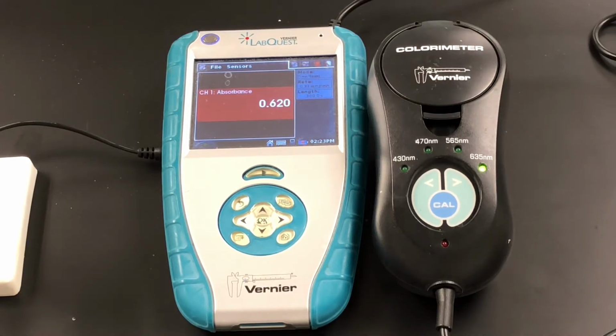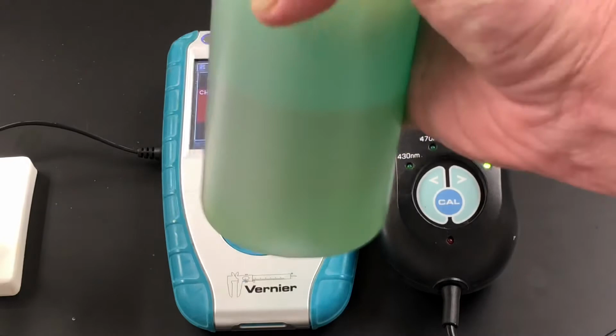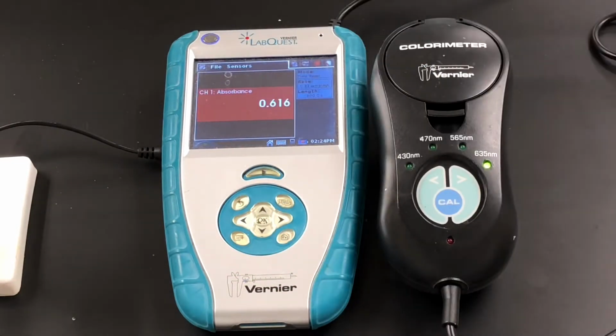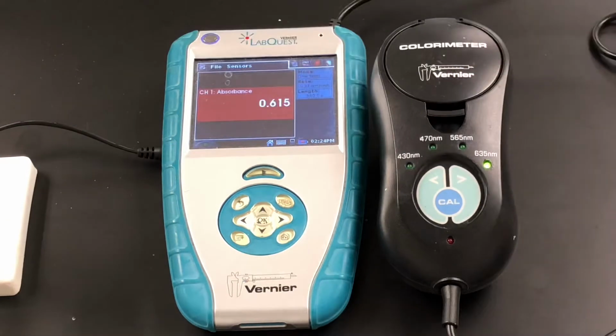Beer's Law. We are going to be using Beer's Law to determine an unknown concentration. The chemical that we're working with is this green stuff here. This is a copper solution, a copper sulfate solution. It's not shown on the bottle what the concentration of this is, so we're going to determine that.